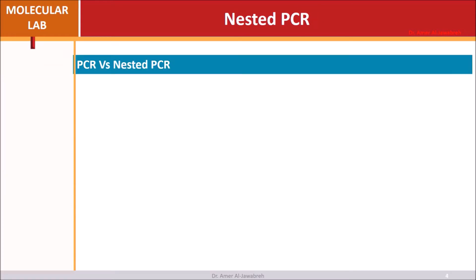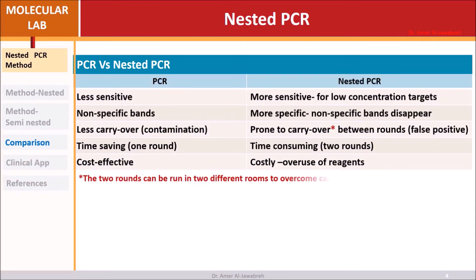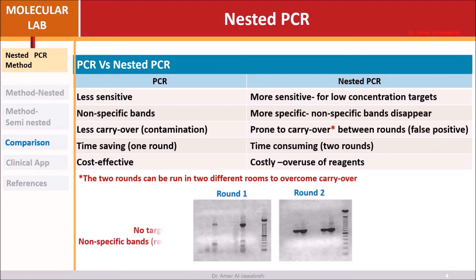Comparing PCR versus nested PCR: nested PCR is more sensitive and more specific, but prone to carryover contamination, which can cause false positive results. In round one, no target bands appear but non-specific bands are visible, as shown by the red arrow. In round two, target bands one through four appear while the non-specific bands disappear.